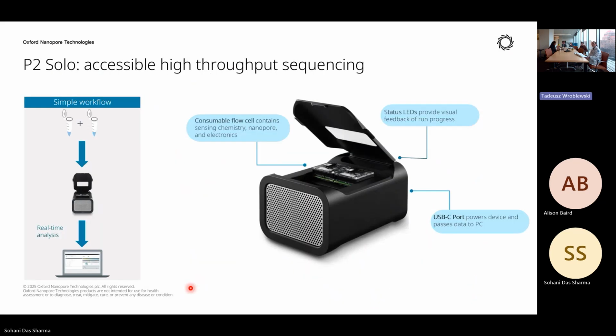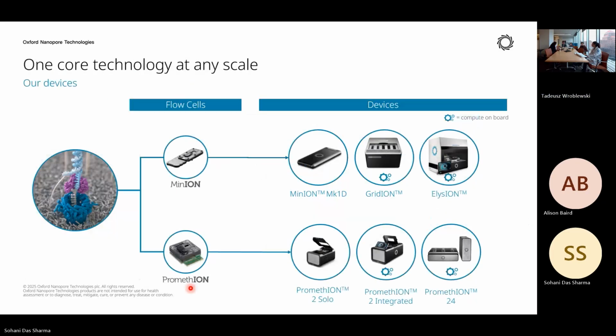Okay, so how long does it take to sequence? It depends on what type of sequencing you do. You can do longer sequencing, but there are not that many pores. So I think usually a day is the maximum people are running.